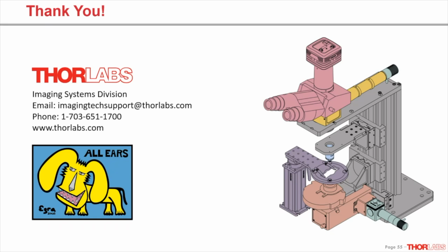That sounds great. I have another question about DIC. Somebody's asking if they can do reflection DIC for semiconductor inspection. Would there be a difference between a tungsten halogen lamp versus a mercury arc lamp?